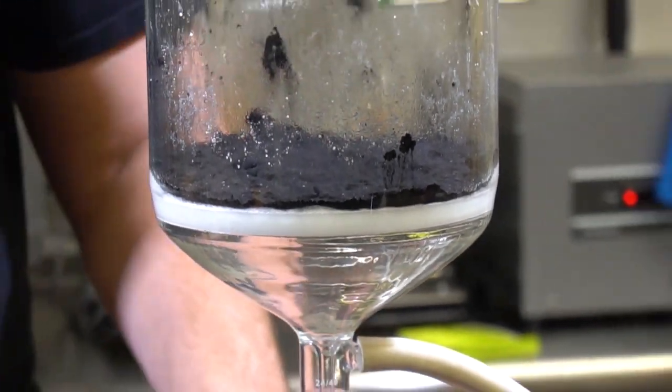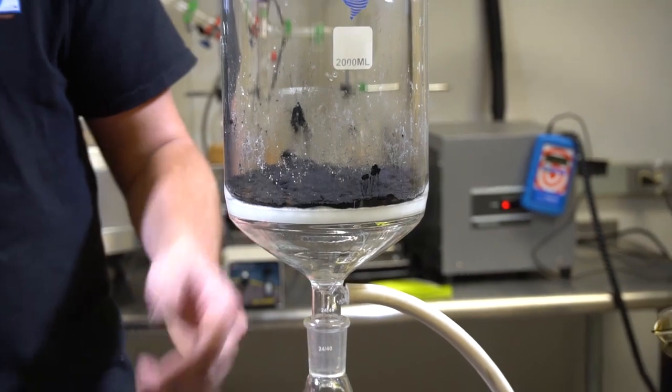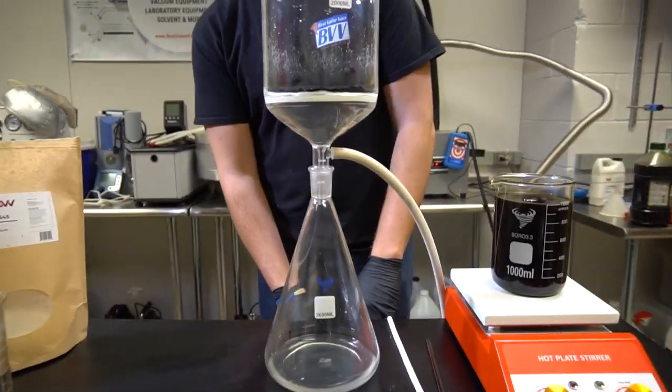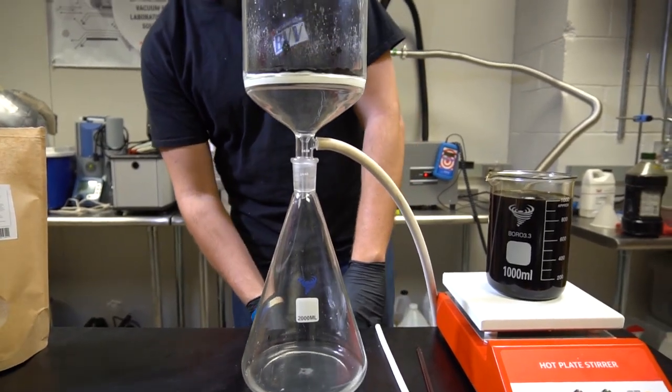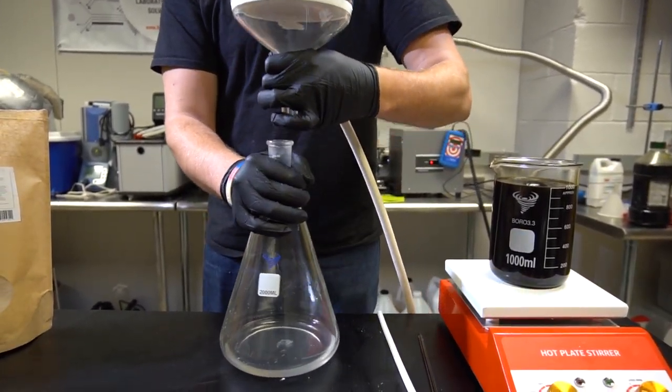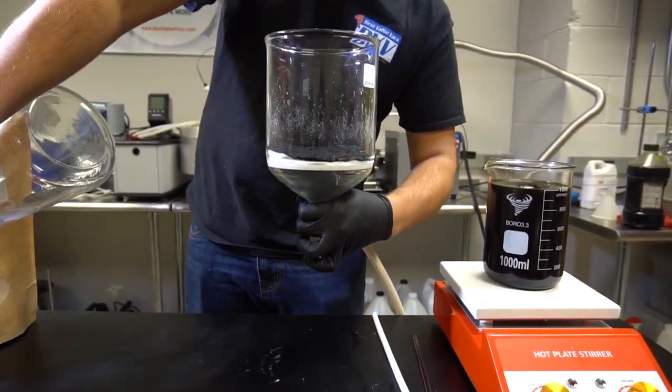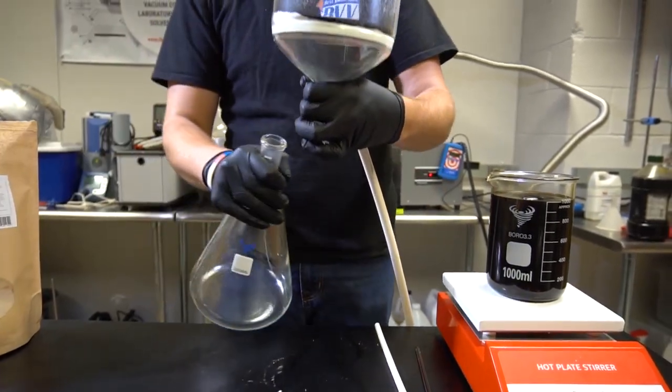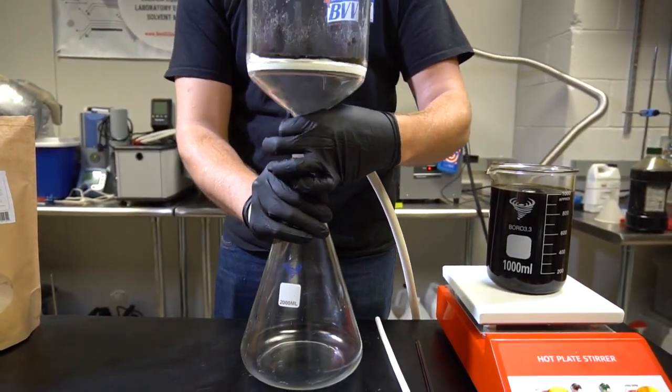Now we're going to let this sit for 10 to 15 minutes to dry out and then we'll put our solution in. Let that sit for 15 minutes while the vacuum is pulling just to dry it out a little bit better. I'll now turn off the vacuum pump. I'm going to empty out my ethanol. And now I'll be ready to put my solution in the top.